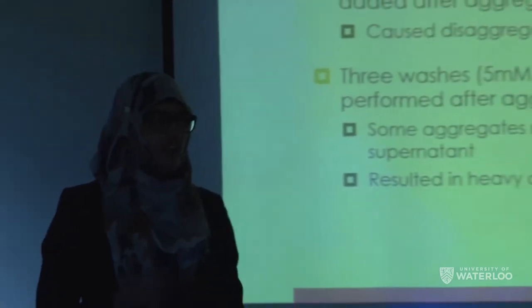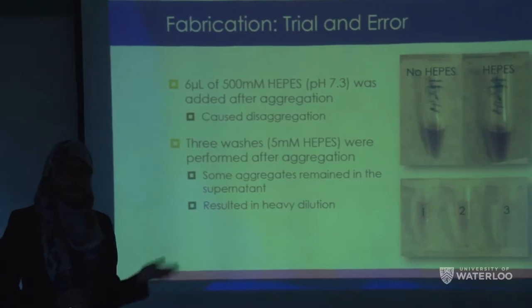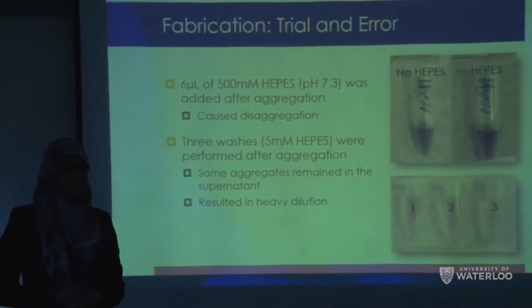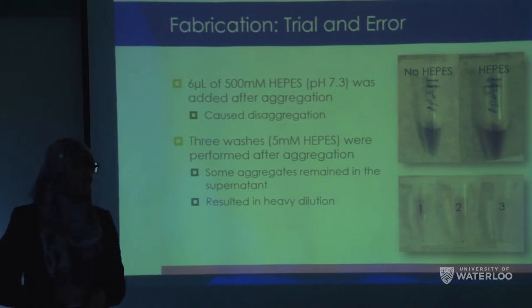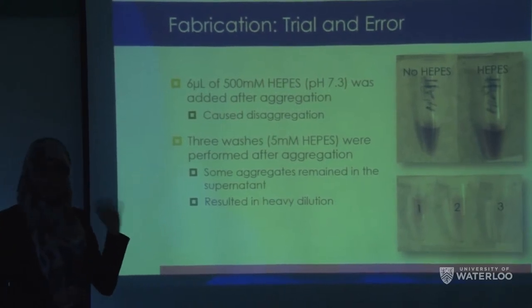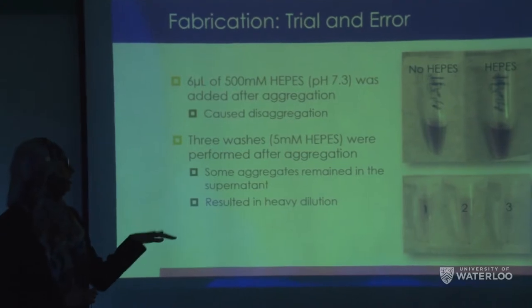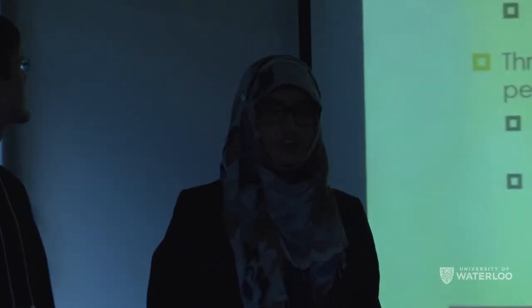So we went through some trial and error in our quest to find the best sensor possible. According to the original procedure we were following, HEPES solution was added after the incubation time to bring the pH back up to neutral. However, when we did this step, we found that it actually caused dispersion of our gold nanoparticles. You can see in the picture on the top, on the left, is without HEPES, and you see the purple of the aggregates. But after adding HEPES, it goes to red, showing that the nanoparticles dispersed. This again renders our sensor inoperable because the nanoparticles are already dispersed. So we removed this step.